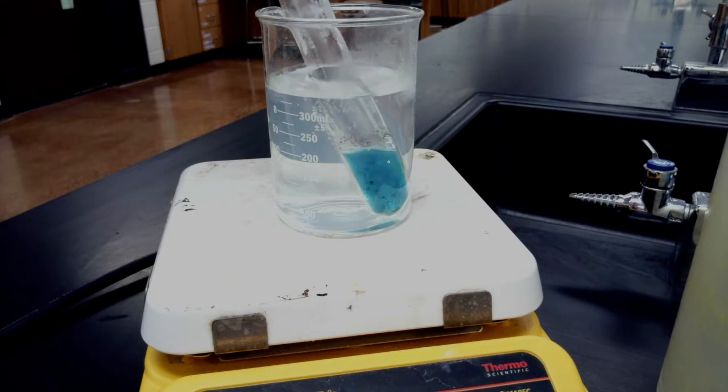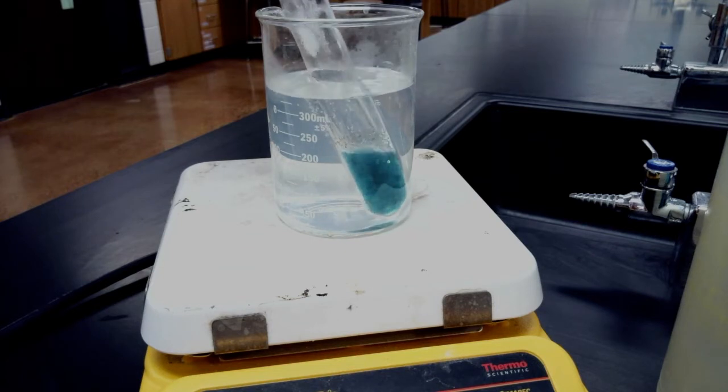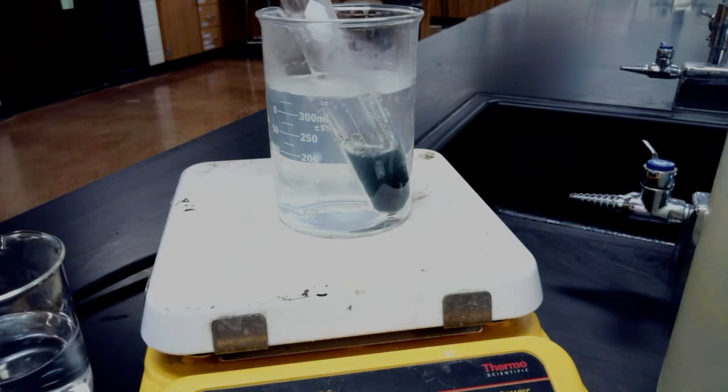You might be able to notice that there are black specks forming at this point. Right now this is step 4, so you'll be recording your observations under the step 4 part of the lab procedure. There's an observation there. If you want to already write this down, the precipitate, or the solid that's forming, is black.